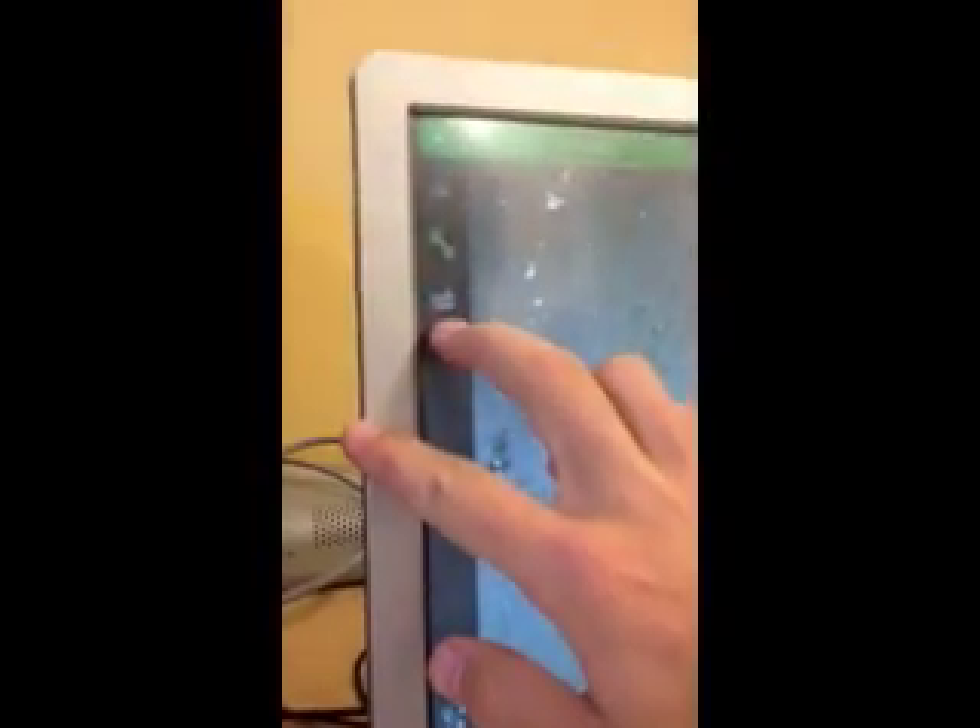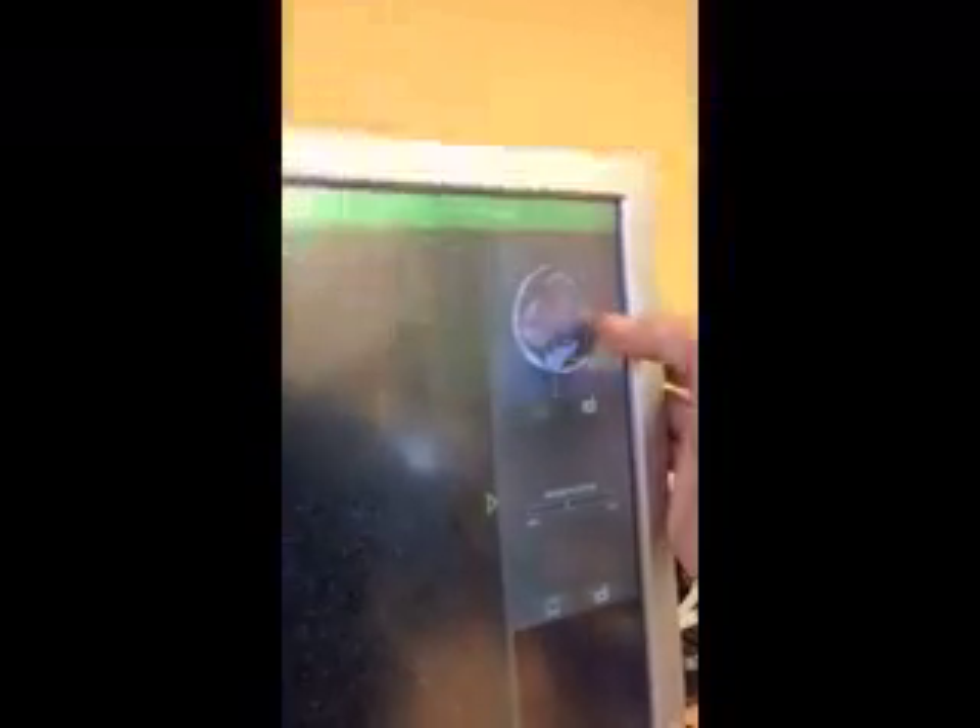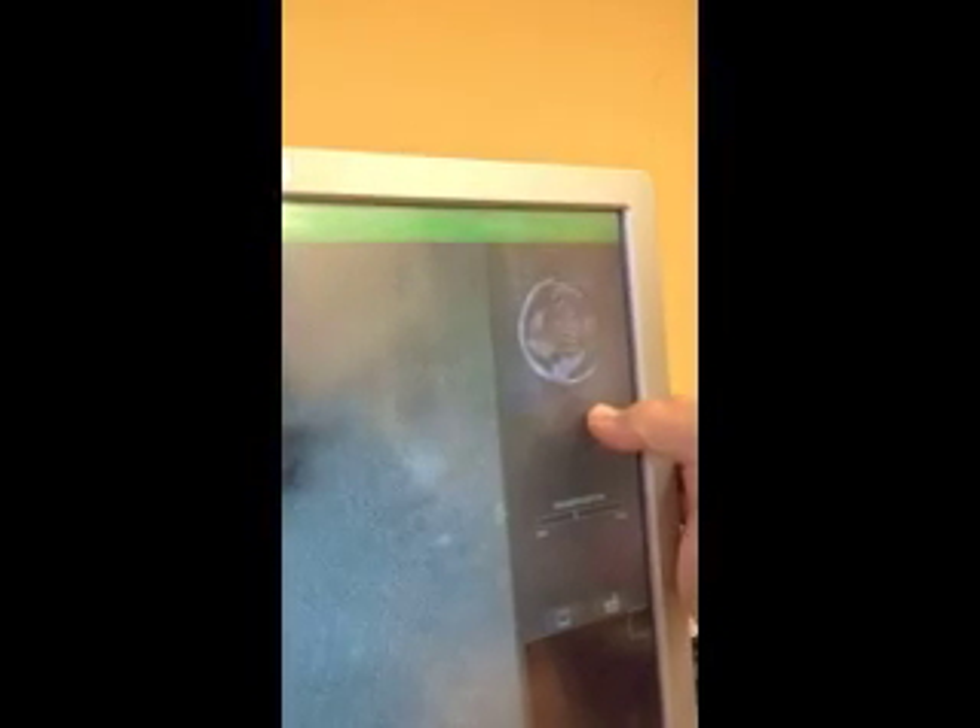Alright, and say I want to take a photo. For this large screen, I would press this camera button up here. So now I want to take a photo of this — I would press this button. And this screen, I want to take a photo of that. And I'm going to take a photo of that. There you go.